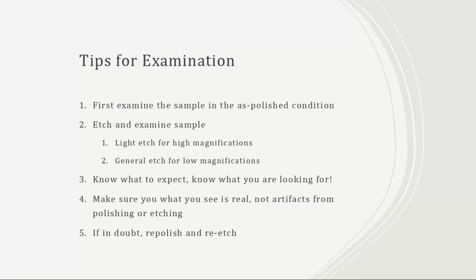So, tips for when you're going to examine your sample. The first thing to do is to look at your sample in the as-polished condition. The reason why it is important to do that is because you are going to look for any anomalies that might already be present on the sample prior to etching.